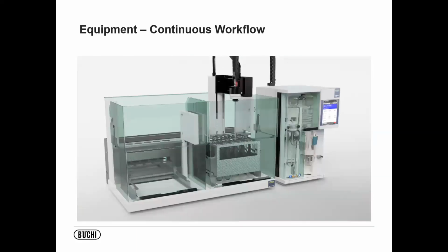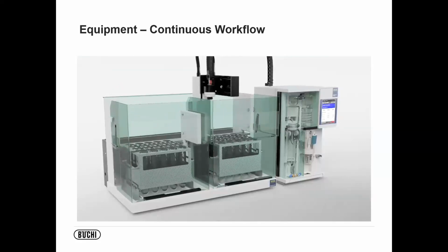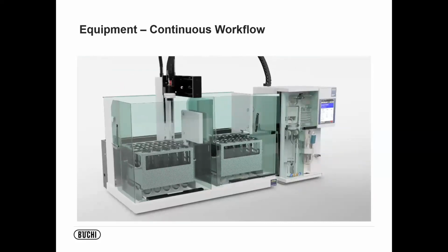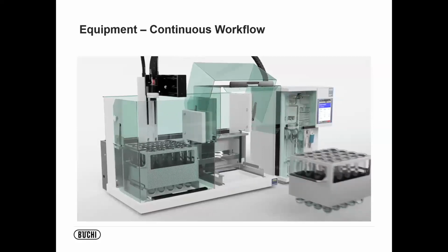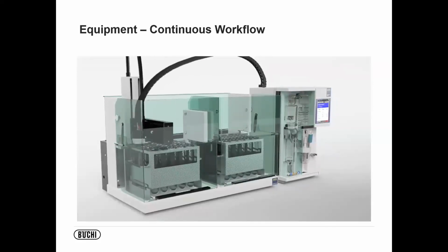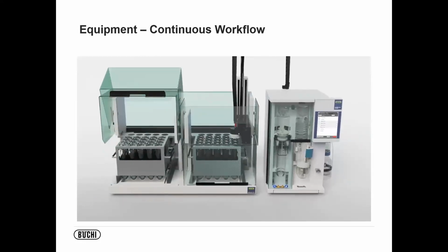It's going to transfer the sample via steam distillation. So there's also no physical movement of the tubes; the automation is really done through that tube, which means there's no risk of damage, of the tube reaching down and breaking anything or becoming clogged. It's distilling directly into the system, and then it's going to run its titration, run a cleaning cycle, and then move to the next. As you can see, one of the racks was just removed and then replaced. So in this particular setup with a 48 position, you're able to load 24 samples, change the rack, load 24 more, and you can continuously run this for a long time.